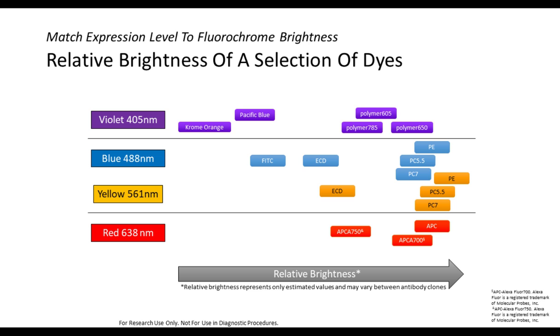Of note, this ranking here is really just a qualitative ranking. So there will be differences in how these dyes are relatively bright to each other if you consider different clones or different conjugation chemistry. Sometimes the formulation of the antibody may also play a role.